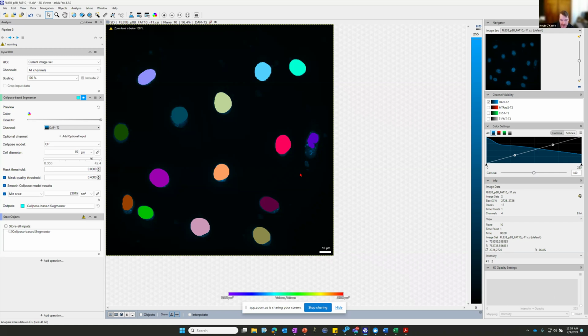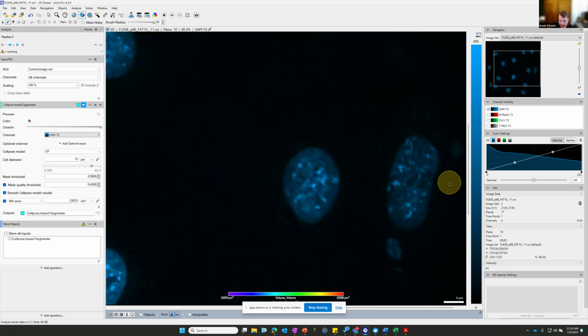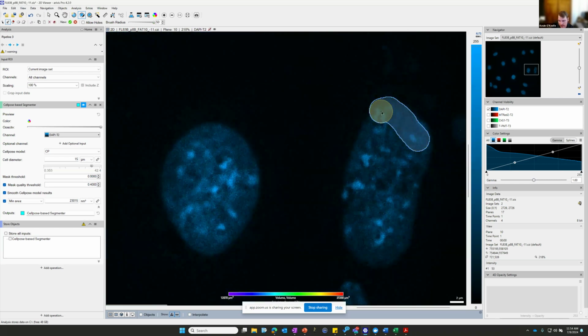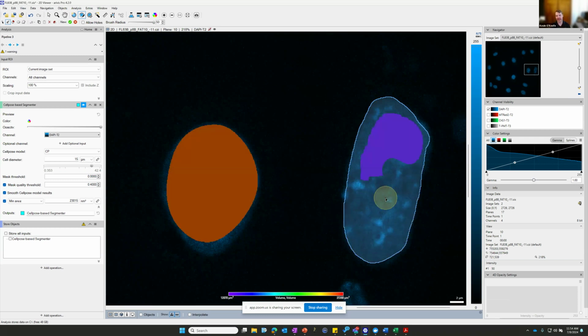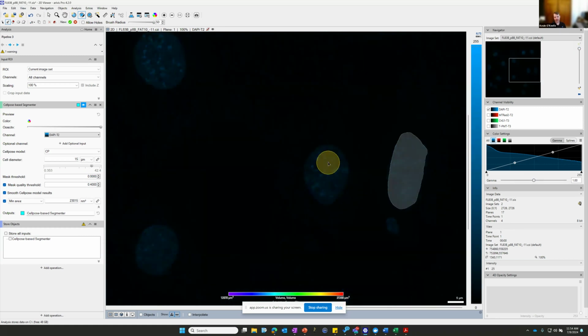And then you would go into the GUI and say, hey, it messed up on this plane a little bit. This is what it should look like. And then you would literally just annotate it the correct way. Once you annotate it, it's going to update and say, okay, let's do another retraining, and then it'll correct it. And then you would just go through a few more planes, see how the result looks, and if it's messing up in another spot, go and correct it.